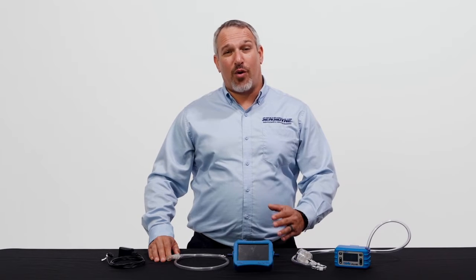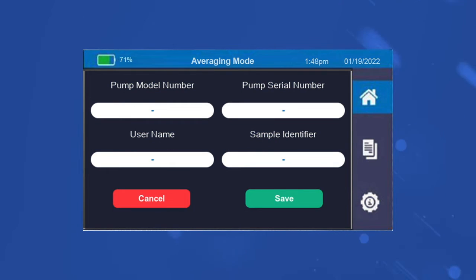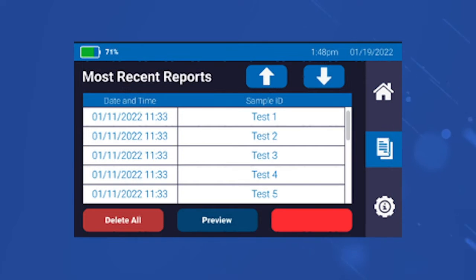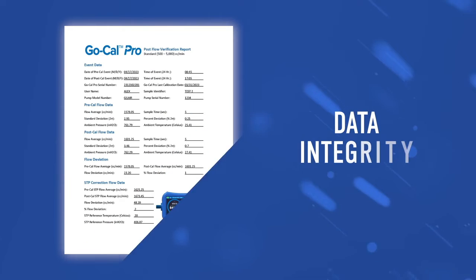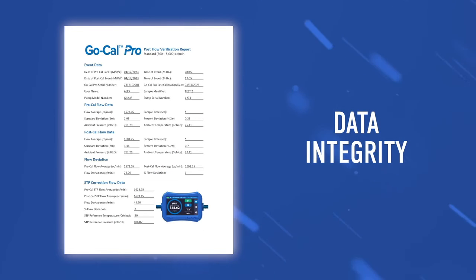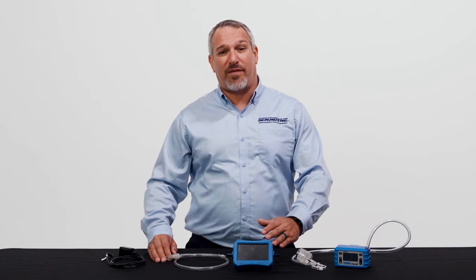The last benefit for the GoCal Pro that I'd like to discuss is sample integrity. The meter creates a digital traceable record which ties all aspects of the sample train together. The flow verification event is then stored, and a report can be previewed on the device and downloaded to your computer with the same USB cable used for charging. The flow verification report provides event information as well as information about the flow meter being used, such as the serial number and the date of its last calibration. It also allows for the ability to compare your pre-sample event to your post-sample event.